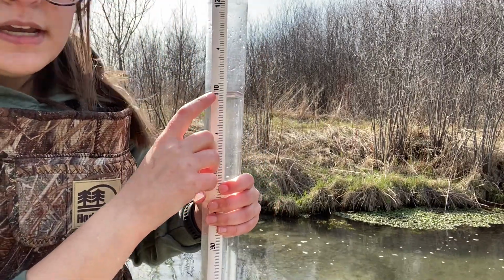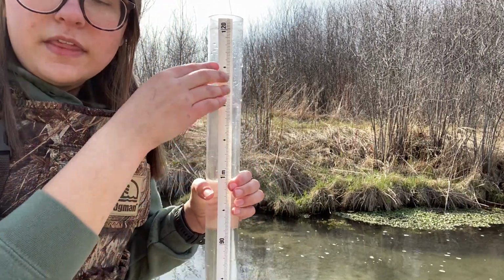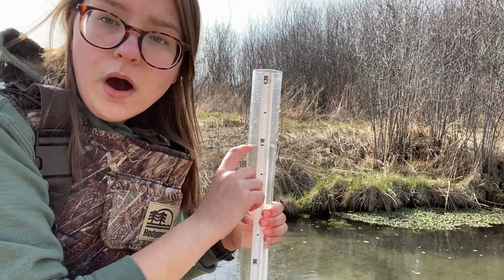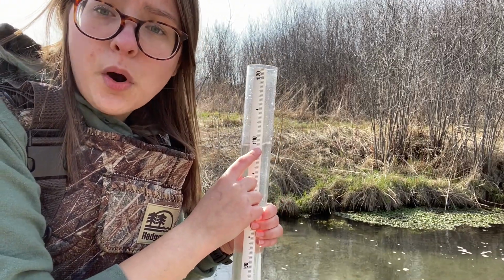And as you can see, there's a tape measure on the side of this. So I'll just go ahead and line up where the water meets, and I will see how much water is left in the tube. The clarity of Bluff Creek, depending on the time of year, it usually sits between 110 and 120 centimeters. This can vary a little bit.